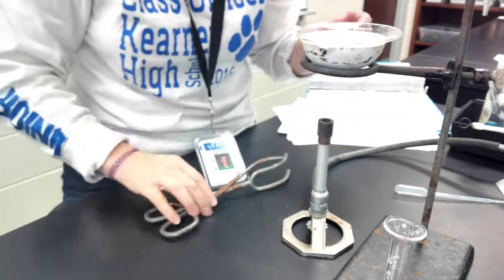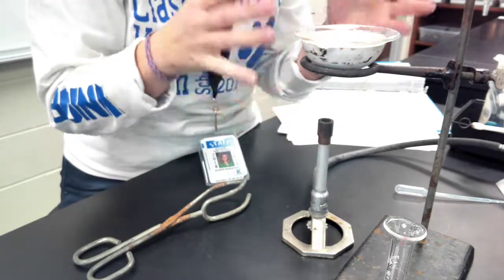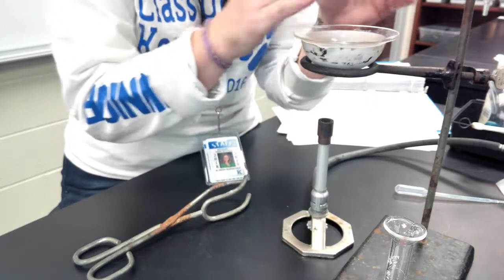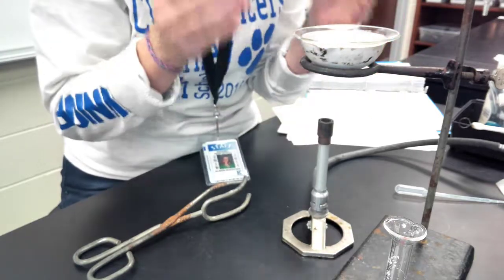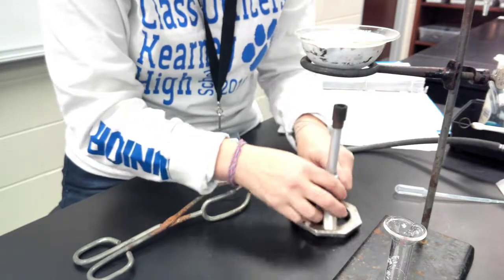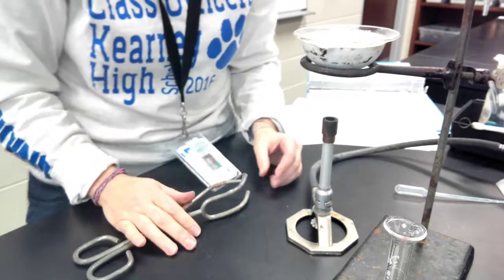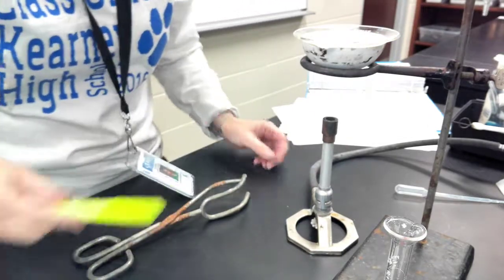Make sure that it's pointing side to side so that it doesn't have any steam coming out that could possibly hurt you. So we're heating, we're boiling, it's going to start bubbling, it's going to start popping, and I don't want any of that salt to be lost. This is a controlled evaporation, so don't hesitate to take your Bunsen burner, move it, pull the heat slightly away. This isn't a race. This is about being as accurate as we can be.